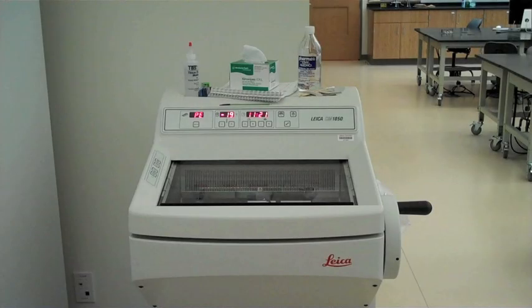Cryostats are used to slice frozen, unfixed tissues. We'll be using them for immunohistochemistry.